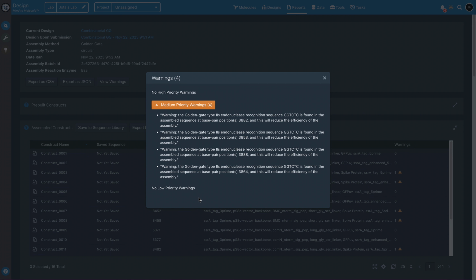You can just keep moving forward. Still, they are there. You can look at them, but it shouldn't be as critical as these other 2 types of warnings.